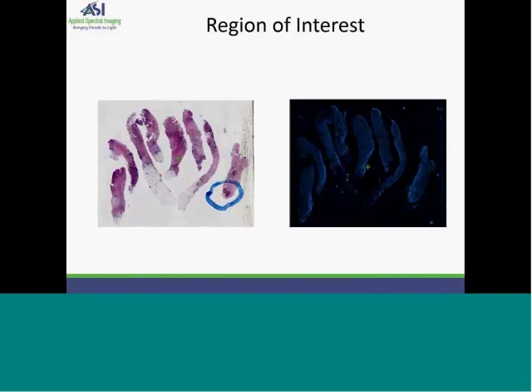And I would like to point out that since we're able to align the images, it really makes no difference that the samples will be facing different directions, being upside down or rotated relative to each other.